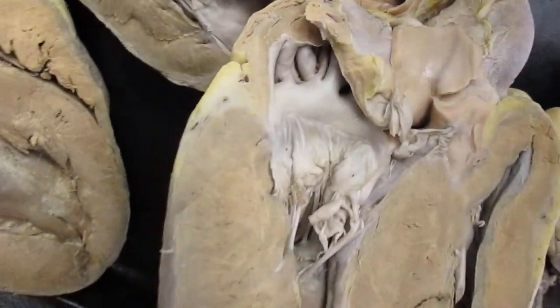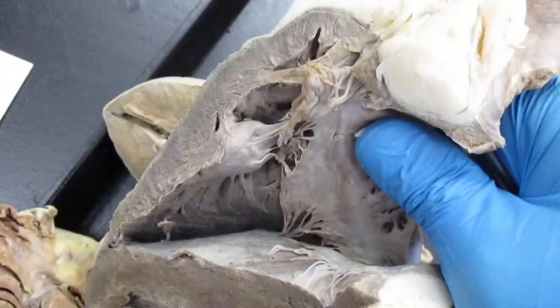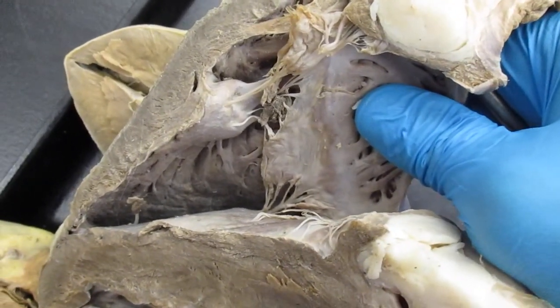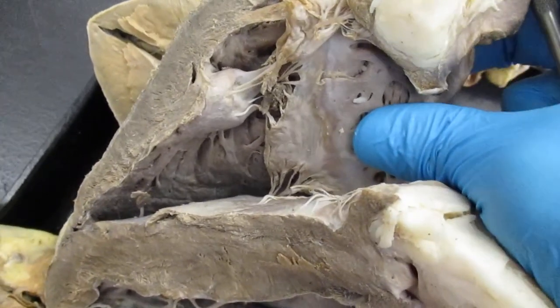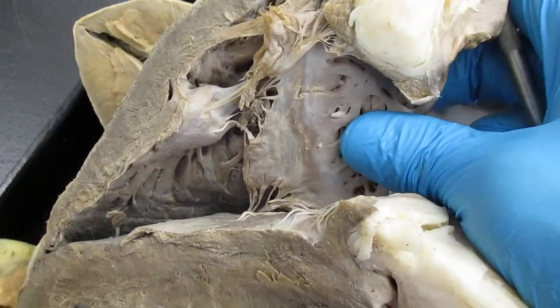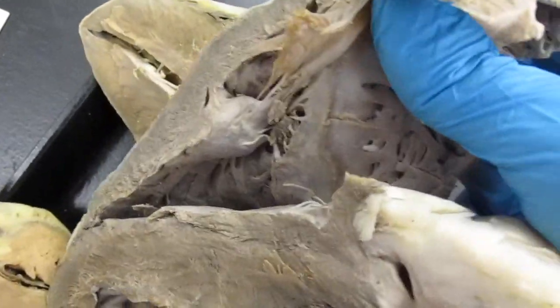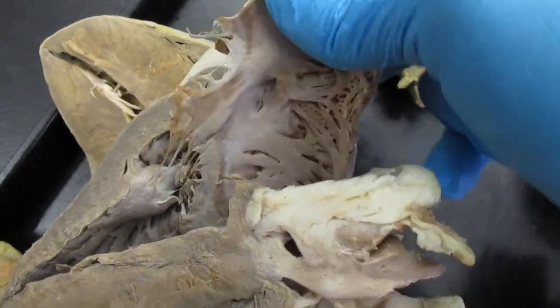And let's see if there's something else I can find for you. Okay, right here, on this heart, you can see the tricuspid valve, which I've cut through here, through the atrium here. Through the right atrium, you can see the tricuspid valve, as we see here, and you can see the pectinate muscles here.